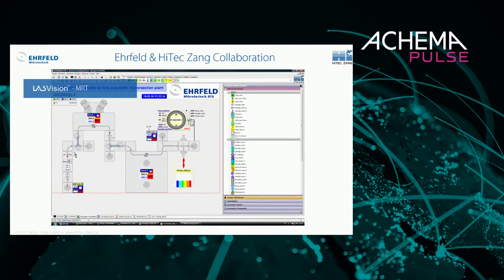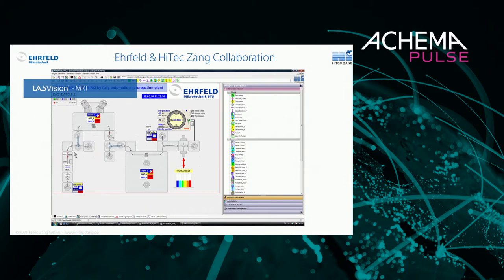This is where the cooperation between Ehrfeld Microtechnik and HiTec Zang really comes into play. Ehrfeld Microtechnik has several different micro reactors as well as a very useful modular setup that can be adjusted as needed. This is then reflected in the HiTec Zang automation software, which makes it very easy to create a visualization, control your setup, write additional programs, use pre-built PID controllers, and interface with laboratory devices such as balances and pumps.